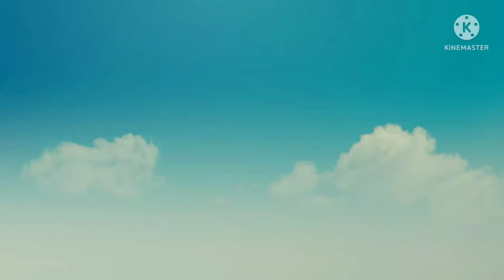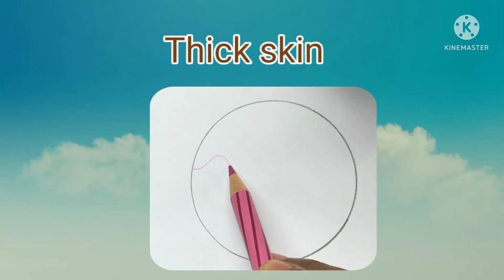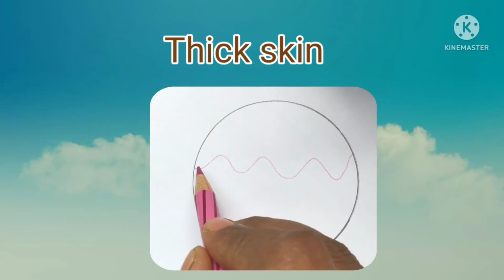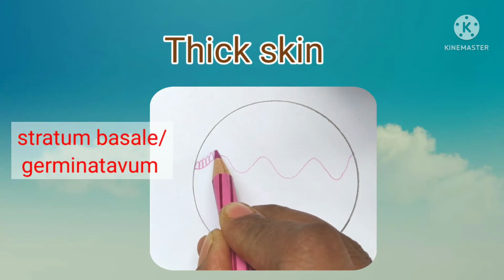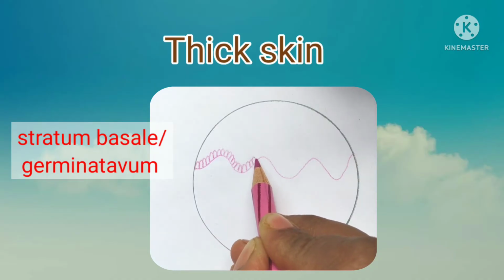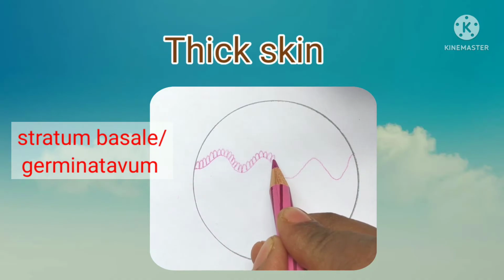Today we'll discuss the skin. We have two skin slides, a thick skin and a thin skin. Both have two main components, the epidermis and the dermis. Epidermis is avascular and mainly it is the epithelium, stratified squamous keratinized epithelium.